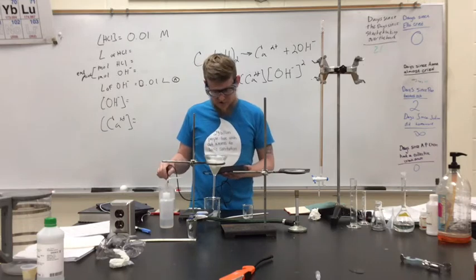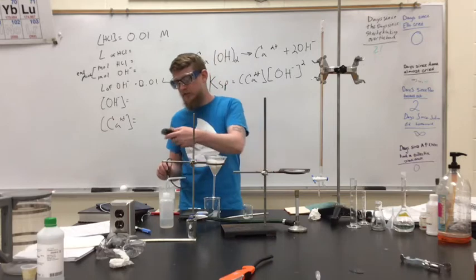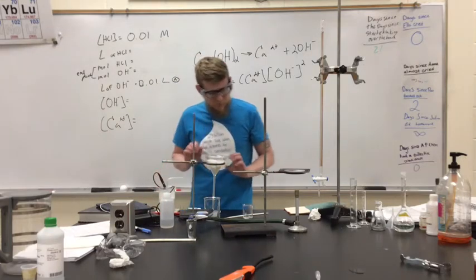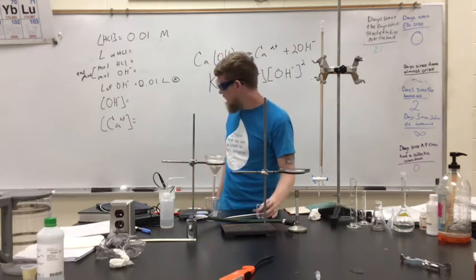It's now at, let's see. So this has been sitting here for a while cooling as well, and it's only at 92 or 91 maybe degrees. So we've cooled a couple of degrees from our 96.5, but we're still going to be pretty sure that this is pretty hot, or was collected at a pretty hot temperature.